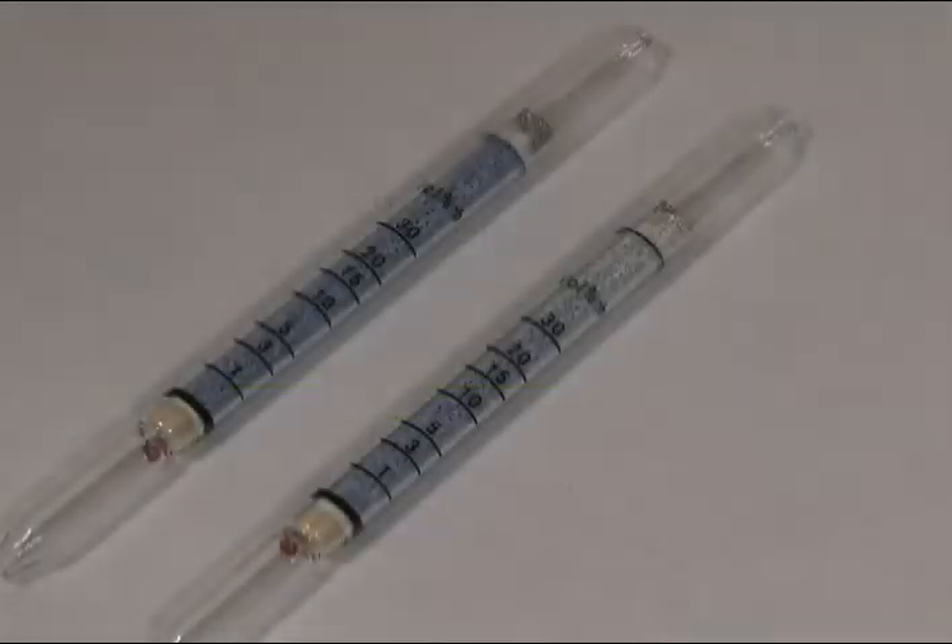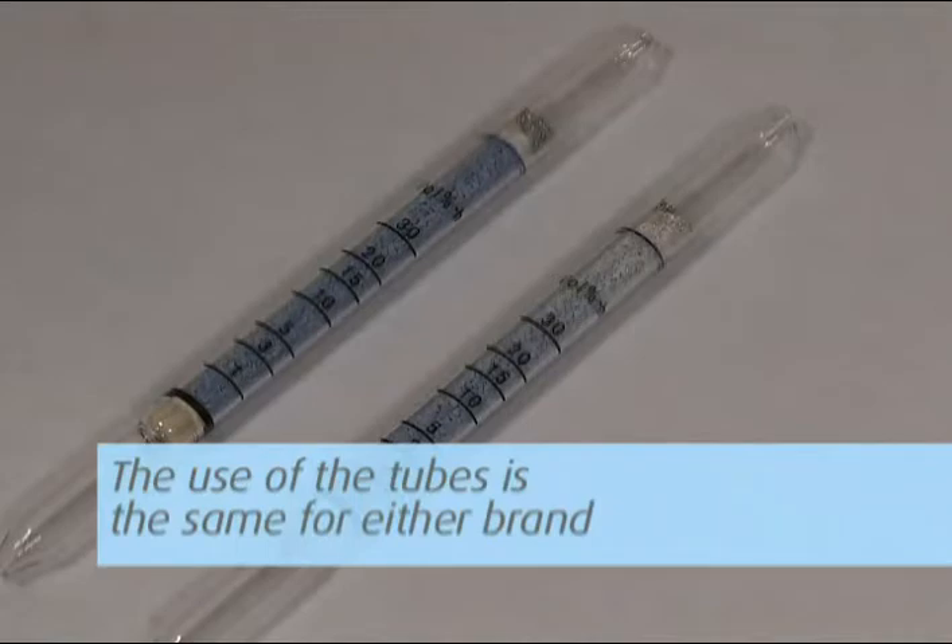There are many chemicals that can be screened using passive colorimetric tubes, either from Draeger or GasTech. The use of the tubes is the same for either brand.